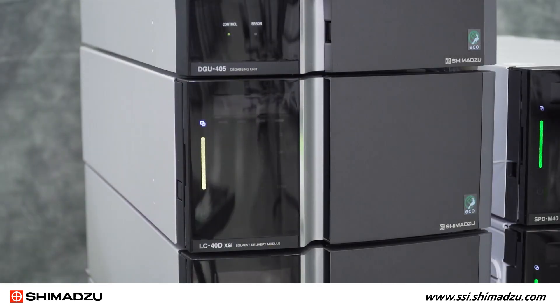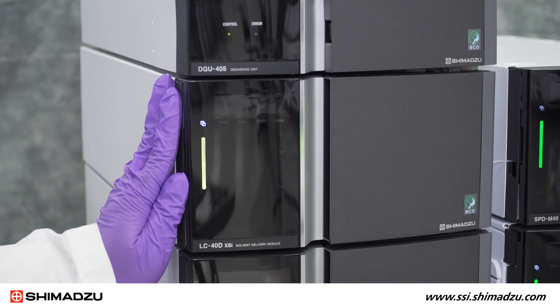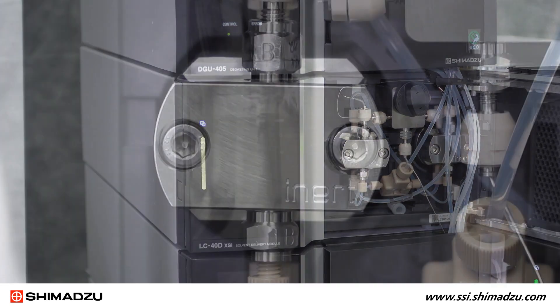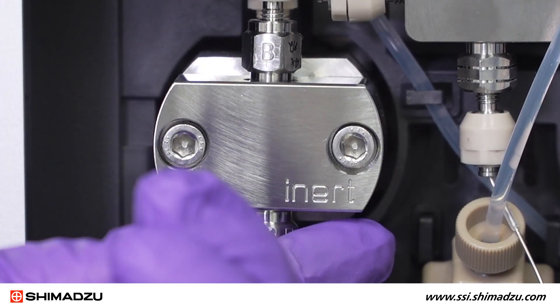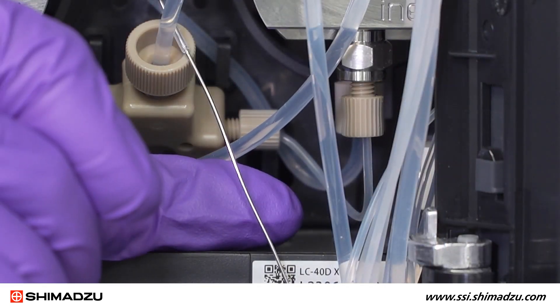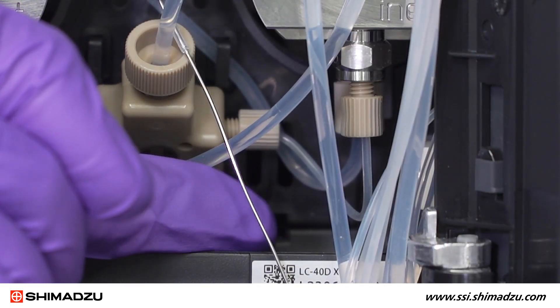Below the degasser is our LC40D XSI inert solvent delivery pump. The pump features corrosion-resistant titanium alloy. If we look inside, you will see the titanium alloy pump heads labeled inert and drain valve, as well as the first glimpse of Peakline stainless, or PLS, tubing.